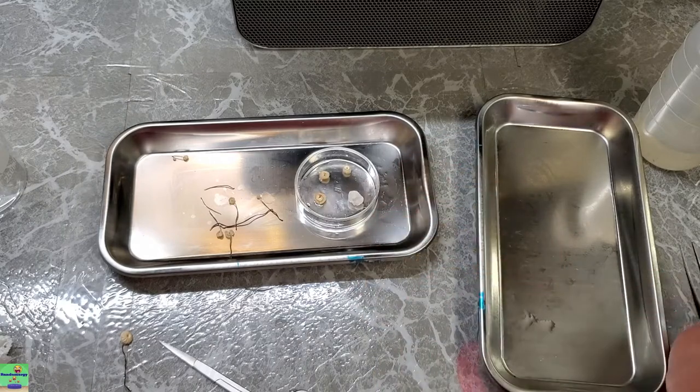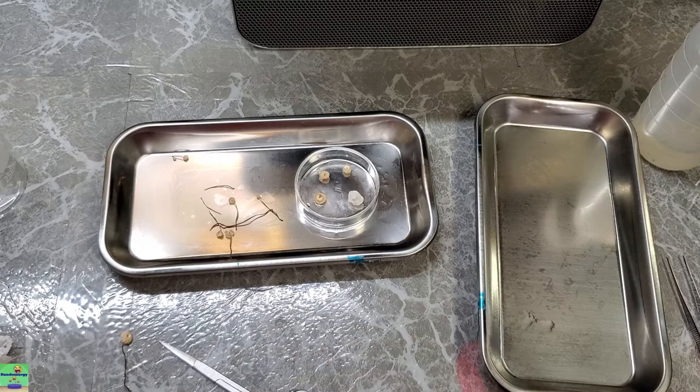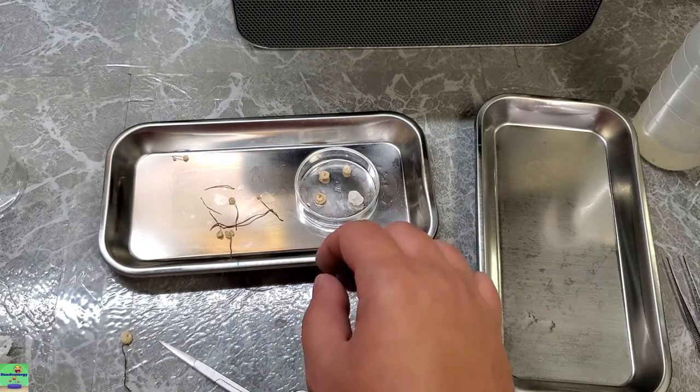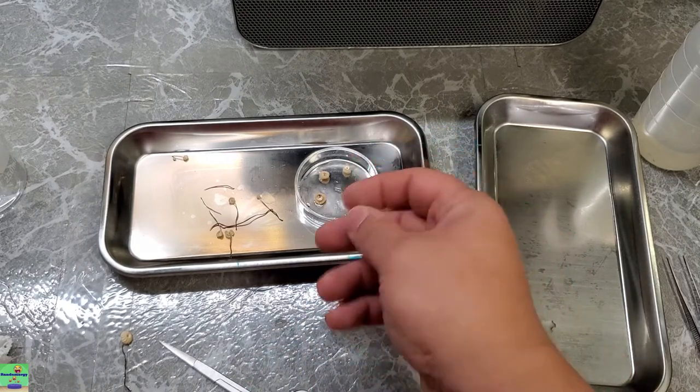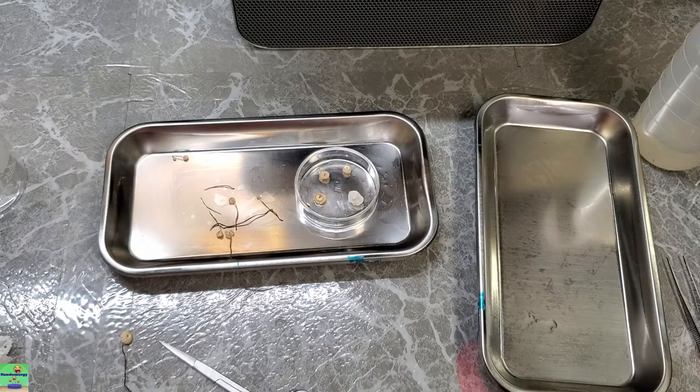And as I was saying, whenever I'm dealing with small quantities of mushrooms such as this, I like to put just a wet, balled up piece of paper towel in here to act as kind of like a humidor's sponge. You know how in cigar humidors you have a sponge that you soak in water to provide moisture? Well, this is kind of the same basic concept.